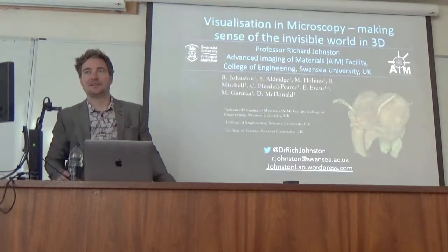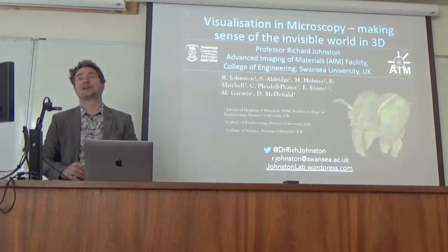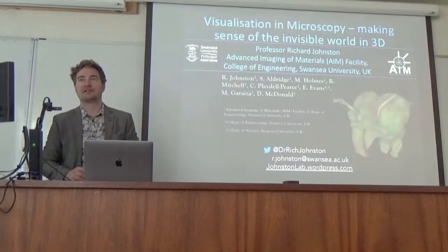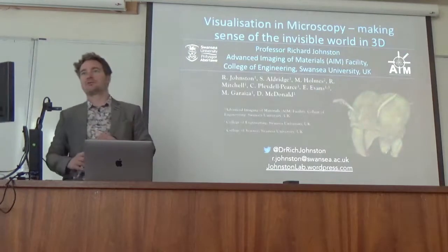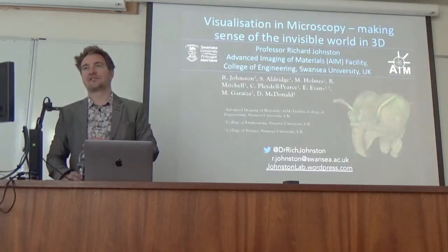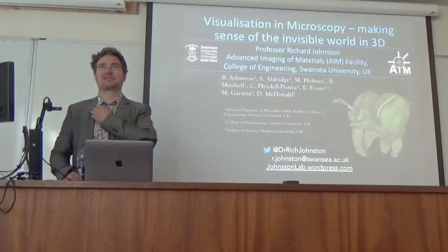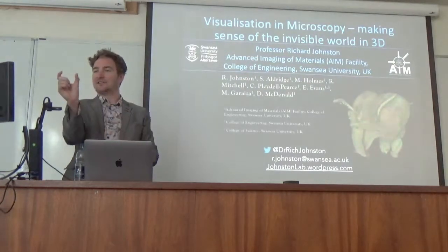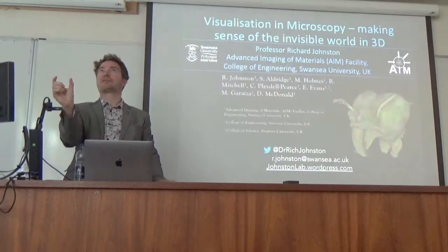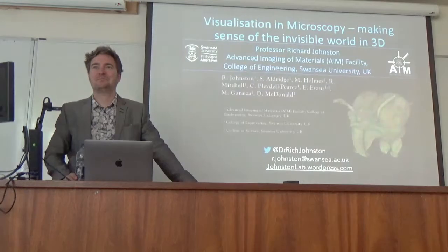Thanks for this really interesting presentation. You had a scan of the mummified cat at the beginning. Did you know how high resolution the image was, and what the raster between the x-rays was? We would quote pixel size or voxel size for micro CT, but I can't remember. I think I scanned it about 6 years ago, and it's still one of those waiting to get out. The skull is about that big. I'll try and work back to the likely voxel size, but it would be a rough guess right now. Sorry. It's in the metadata.